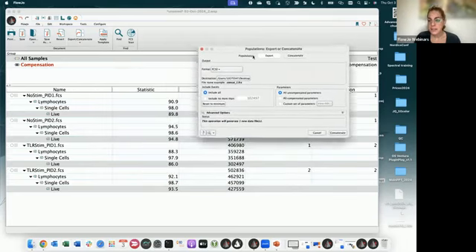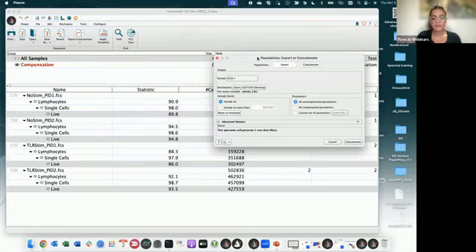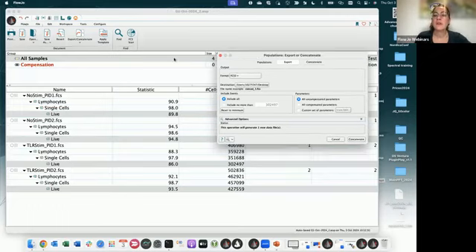Another piece of advice, you can choose to take it or not, but I prefer to compare similar numbers of events within the different conditions. This is to give a sort of normalization within my samples, because otherwise, comparing 1 million cells versus 10,000 cells wouldn't make that much sense, right? So many people perform downsampling. There is a shorter way if you're willing to do that. Instead of performing the step of downsampling, when you concatenate, you can actually choose to include no more than.